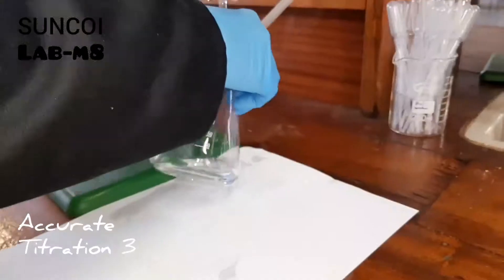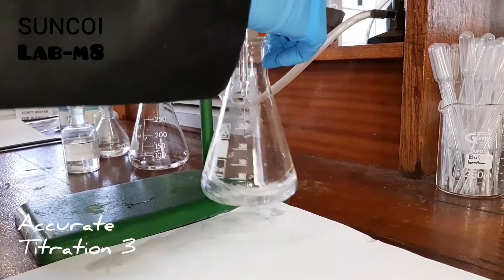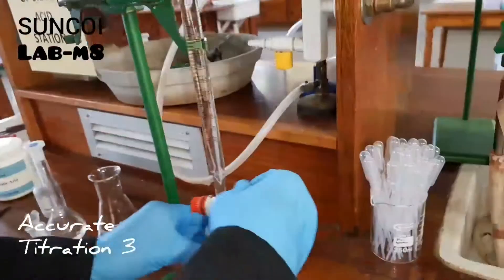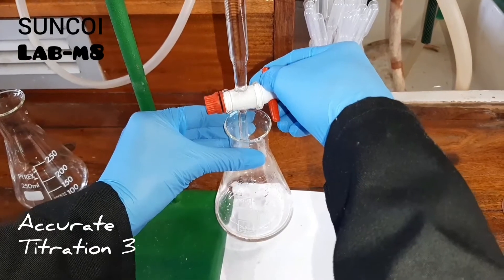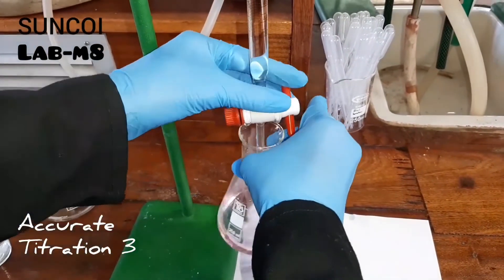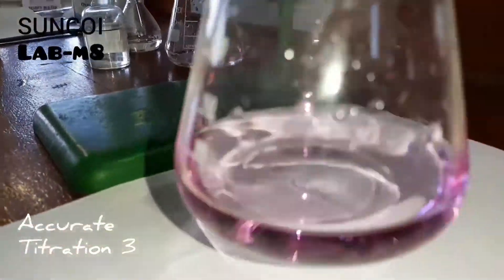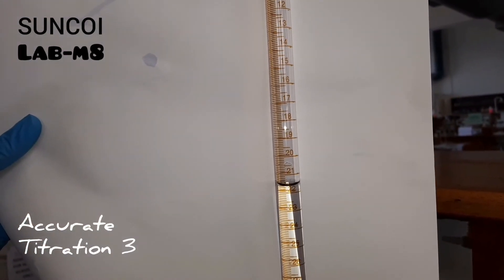This is our last and third accurate titration. Again we have filled up the burette and now Nusrat is titrating. As you can see she's adding — and then it's a matter of one drop — and there you have your end point, beautiful. Take down the volume — can you see the volume?